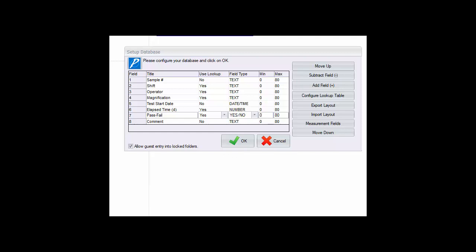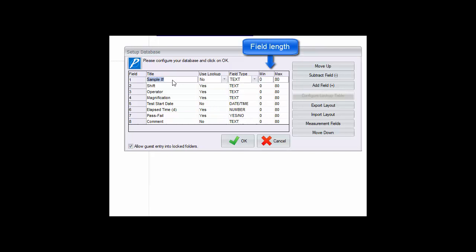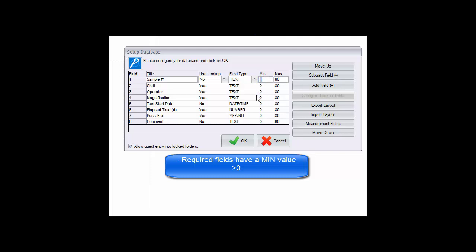Finally we determine if there will be a minimum and maximum number of characters to be used for a field. By default the min value is set as zero meaning there is no minimum. If you want to define a field as a required field in order to save an image, then it may be set in the min column. A certain number of characters may also be specified, requiring not only an entry for the field but an entry of a certain length. The max number of characters is by default set at 80 but it may be expanded to 120.